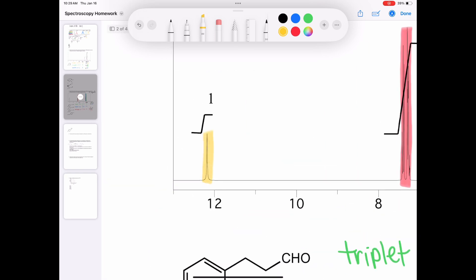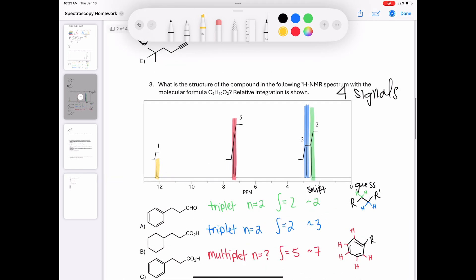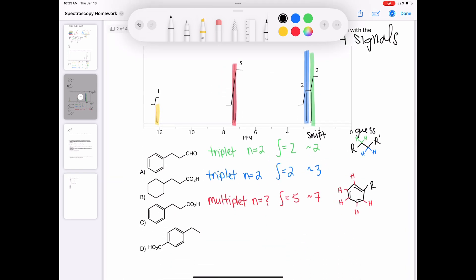Last but not least, there's a singlet that integrates to one and shows up right around 12 parts per million. All three of those things combined — singlet, integration of one, shift of 12 ppm — seem pretty likely to indicate a carboxylic acid group. There's nothing else in our table that shifts that far left, and because it's a singlet with no neighbors integrating to one, it seems pretty likely.